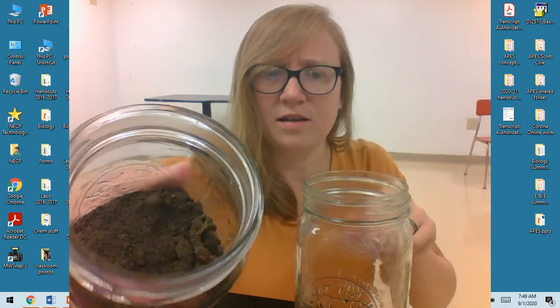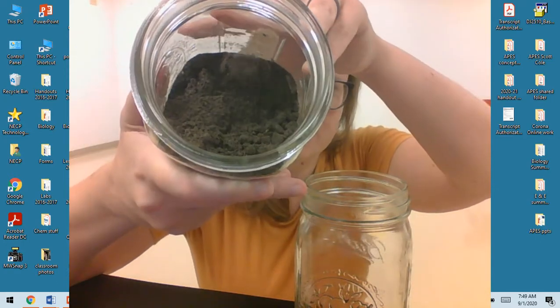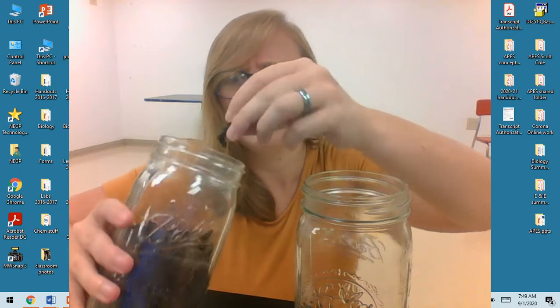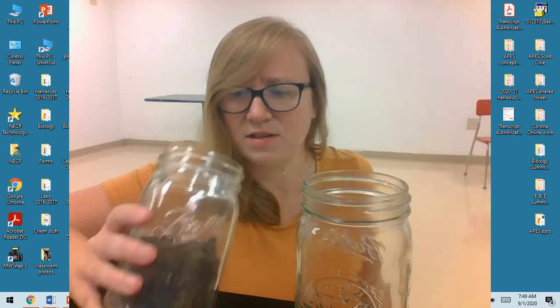But you also want to look in here. I don't know how well you can see. It keeps moving to the bottom and getting buried. But you don't really want to have organic material in here. I'll pull it out. So like roots. You don't want big roots or twigs or stems or anything like that.